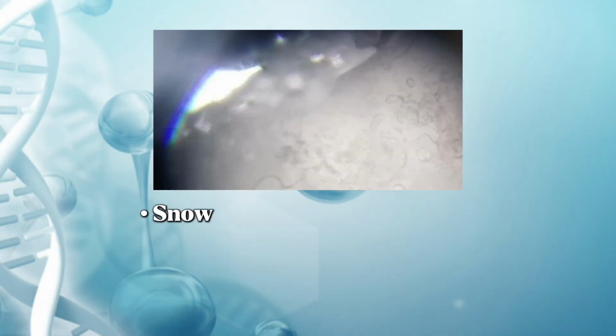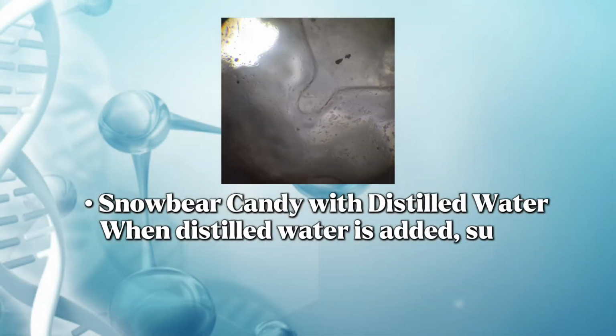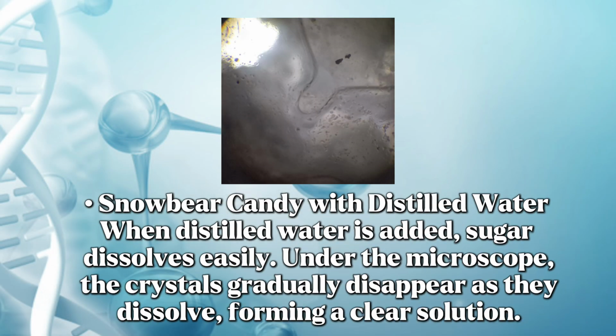For candy with ethanol, sugar crystals dissolve slowly. The crystals appear visible under the microscope, but they become less compact and more dispersed in the liquid. When distilled water is added, sugar dissolves easily. Under the microscope, the crystals gradually disappear as they dissolve, forming a clear solution.